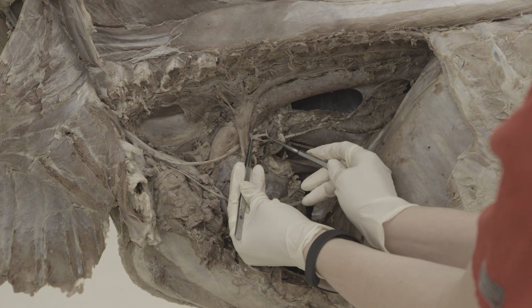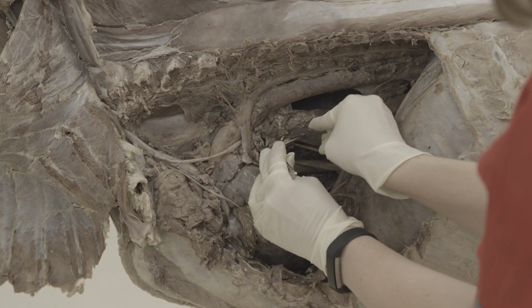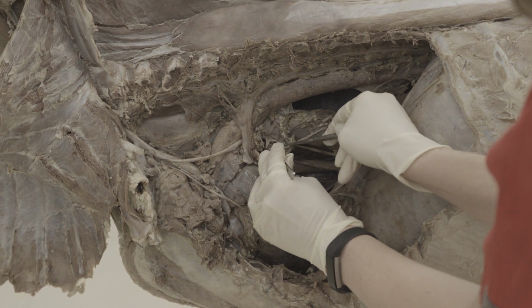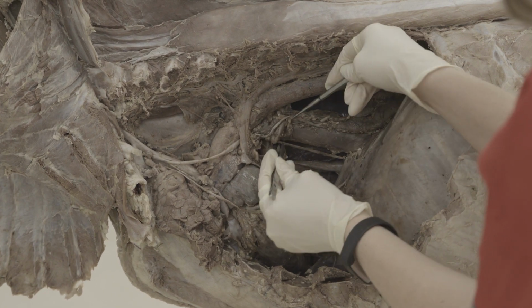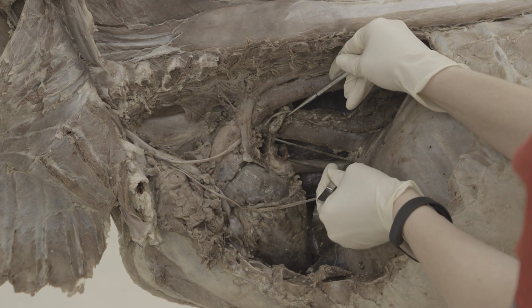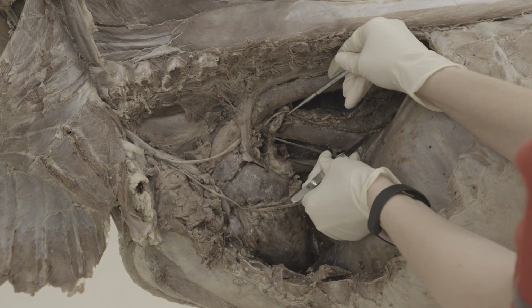Here you have the ventral branch on the left, and it's actually connecting right here with the ventral branch on the right. And so from that point on, you have a ventral vagal trunk. That will run along the ventral aspect of the esophagus here. So, ventral vagal trunk. The esophagus is this big guy right here.